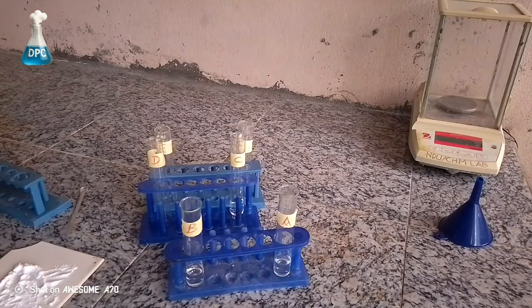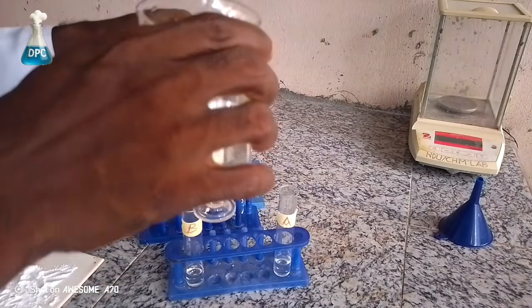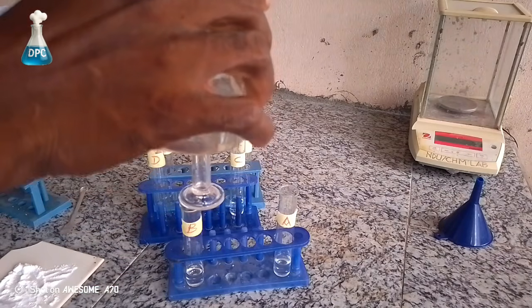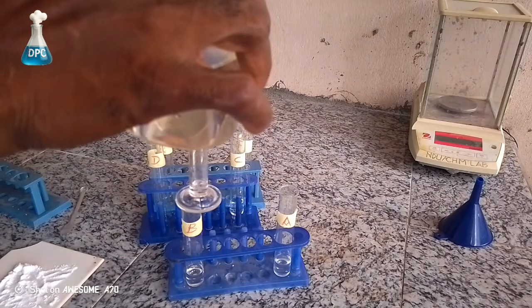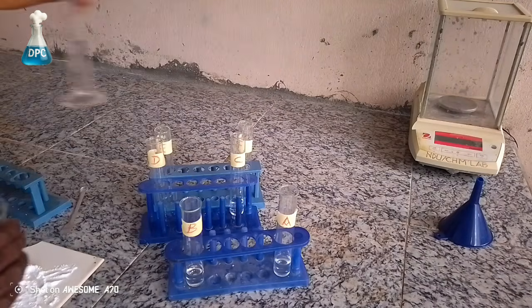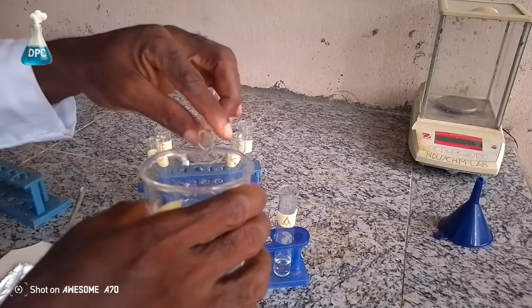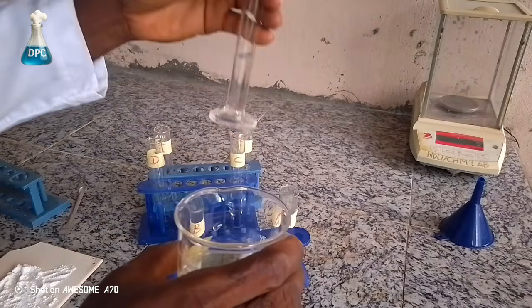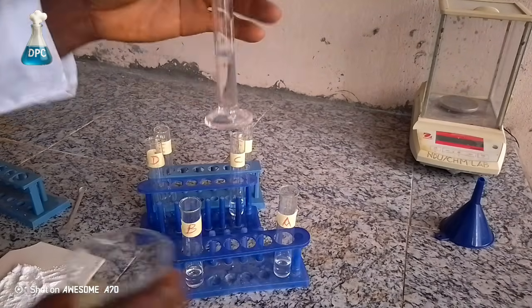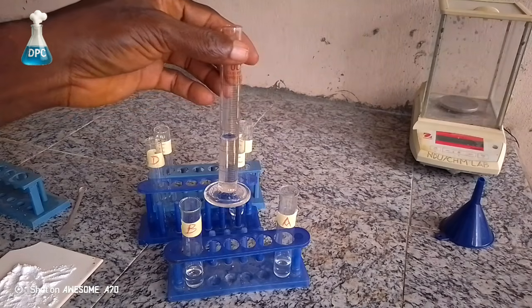Now we prepare to measure our acid into the various test tubes. Now 5 ml of the acid into test tube D. Okay, that is 5 ml.